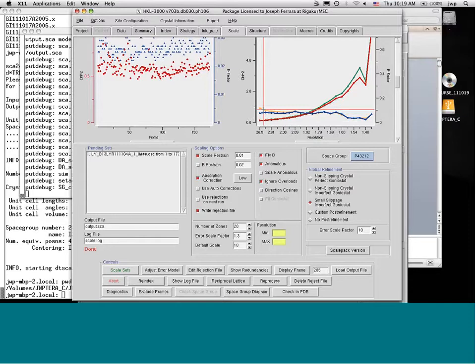So you expect the chi-squared to be higher if there's an anomalous signal. The blue is when I plus and I minus are kept separate. All reflections belonging to reflection off of, say, one side of the reference planes in the crystal, the I pluses, are treated together. Combined is not the right word.